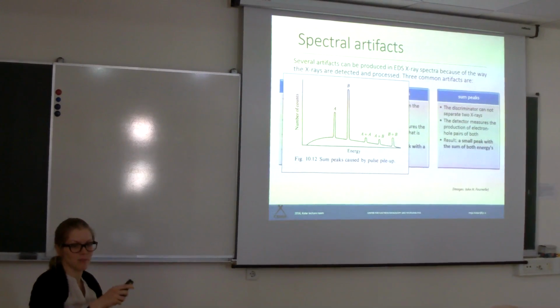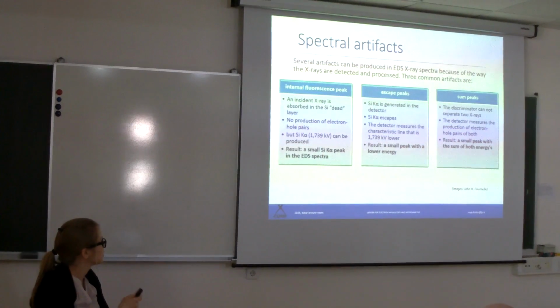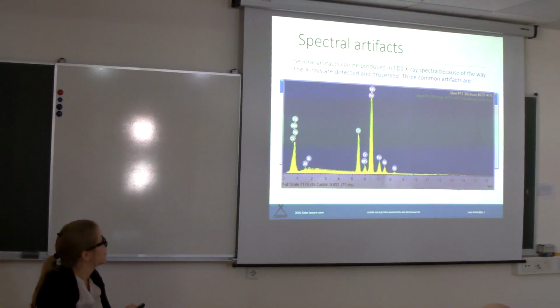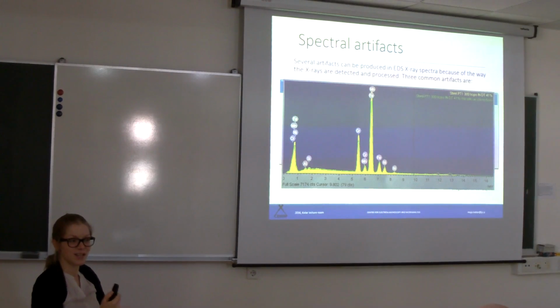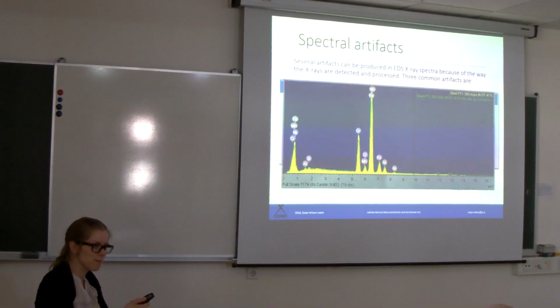Correct, pulse pileup. You have it. You can check it. Or I have it here. This is your spectrum, and if you uncheck pulse pileup, you will see that you actually got the sum spectrum, but Inca is really smart, so it doesn't allow you to do stupid things. So it will say, this is a pulse, this is some peak of some other peak that you have.